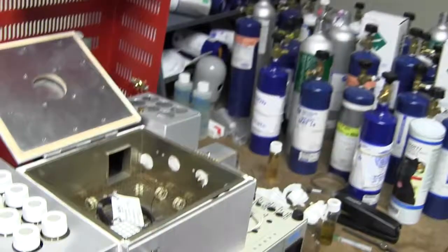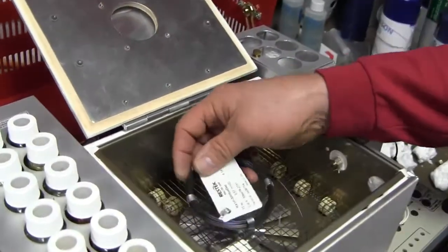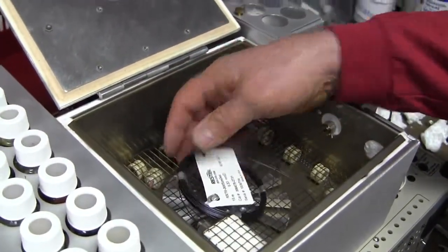Hi, my name is Hugh and I'm going to show you how to remove and replace the column in the SRI 8610 Cannabis Testing GC. The column is in the column oven of the GC.